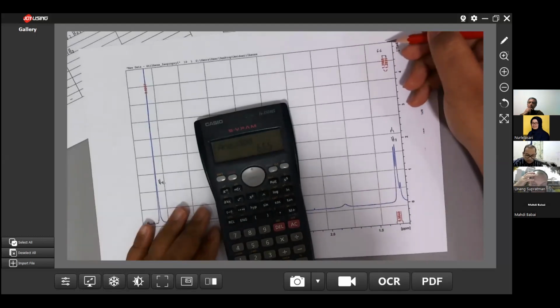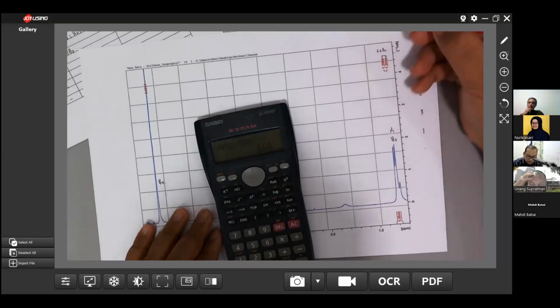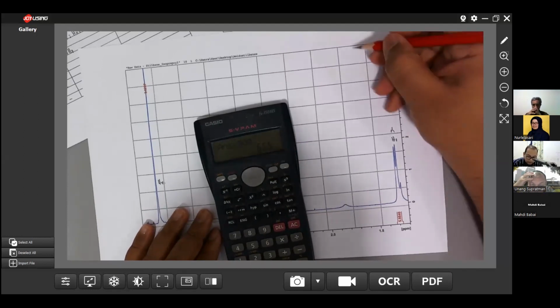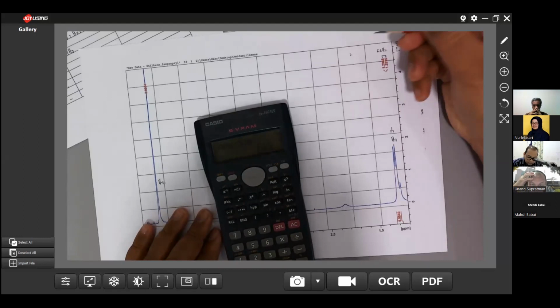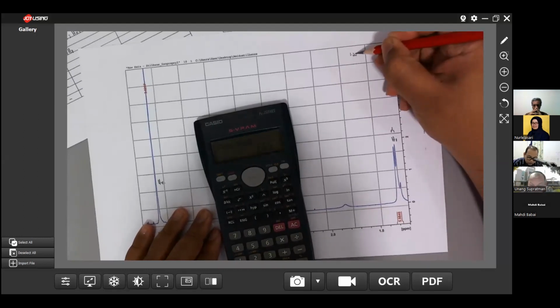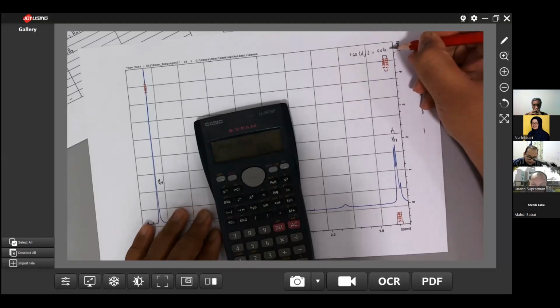6.7, okay, that's okay. So you can put it is okay. This value is around 1.296, about 1.30, doublets, J coupling here. Okay.